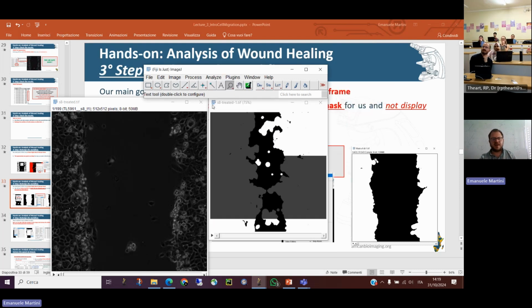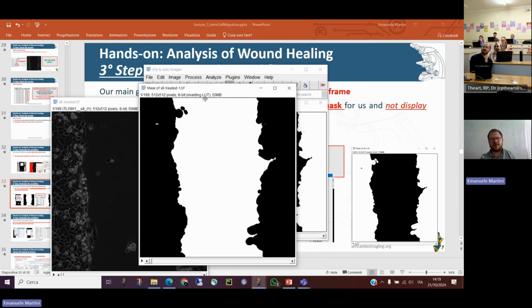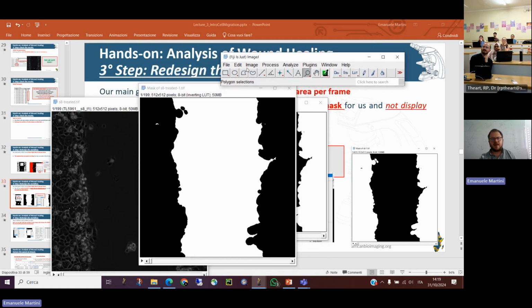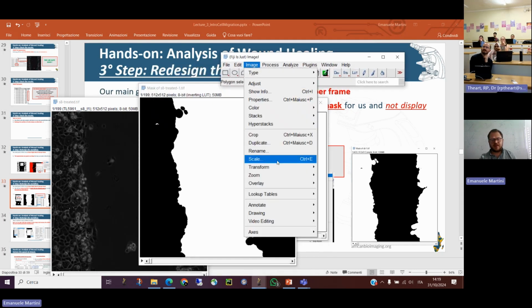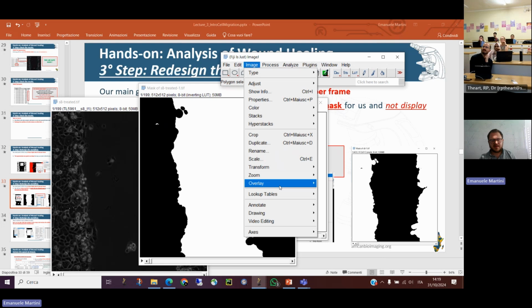I say always okay. If it works well, it will show you something like that. This one, I need to invert because I want to see black and white. Let me find it. Where is it?